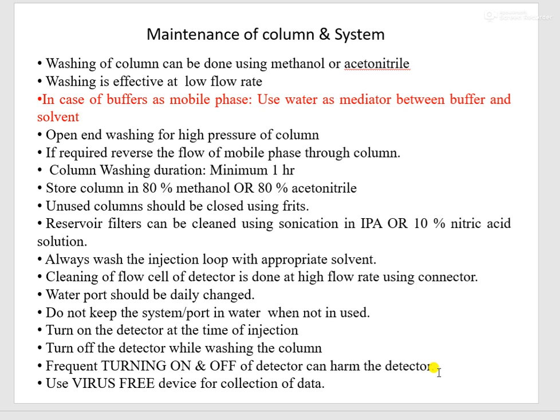And very important, whenever you are collecting the data for documentation purposes, you should use a virus free device. Otherwise what will happen, if you are using a pen drive or some device which has got a virus, and you are using that device containing a virus on your system or your computer, the virus will enter the computer which is attached to the HPLC, and it will hamper the software performance.